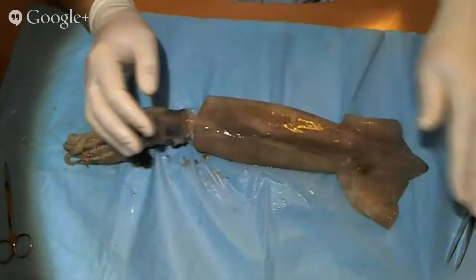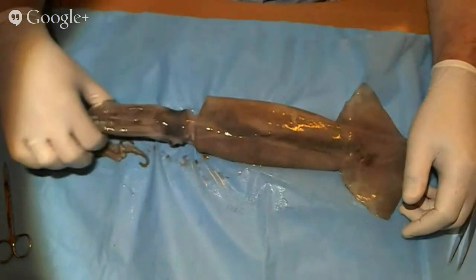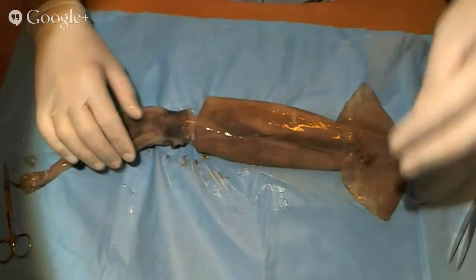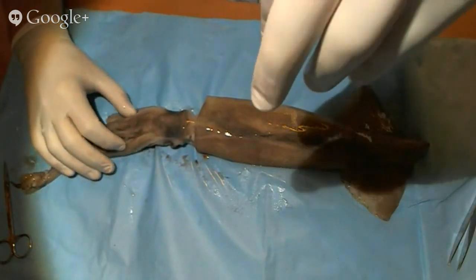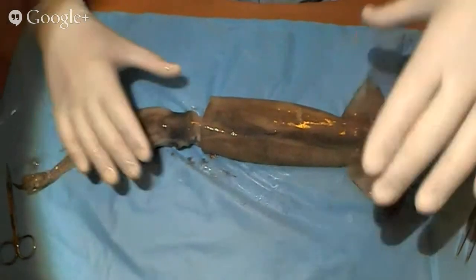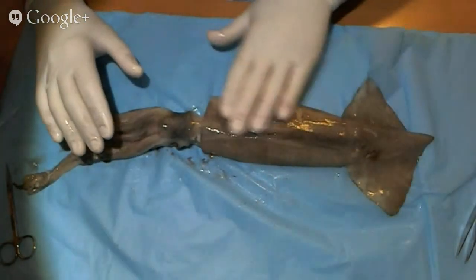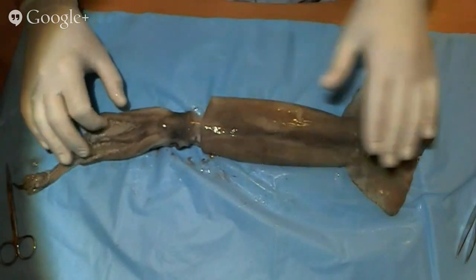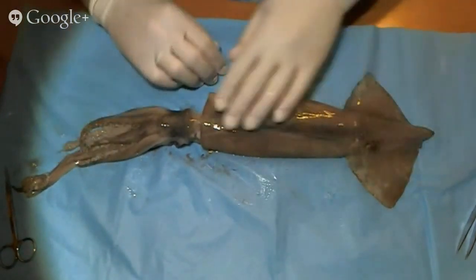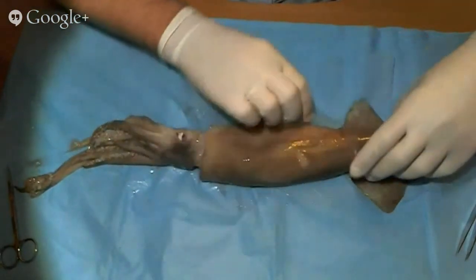So we'll talk about that this is the dorsal side, and that you can talk about coloration for camouflage, that if a predator is looking down on the squid, then it's going to be looking down into the deep dark ocean, and if they have darker spots on the top, then it's less likely that a predator will see the squid. And same thing happens, but from below.